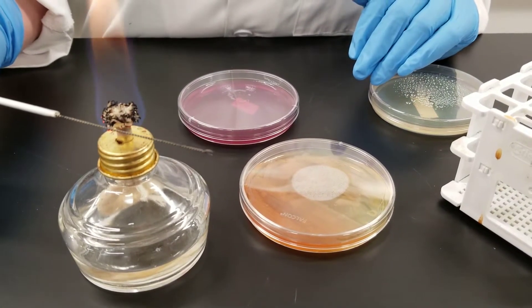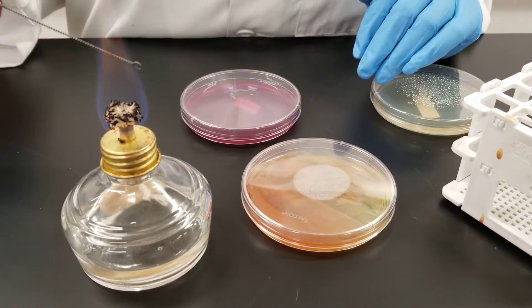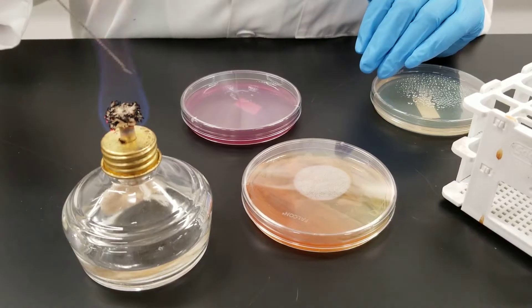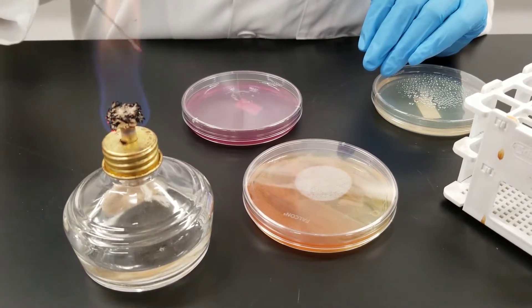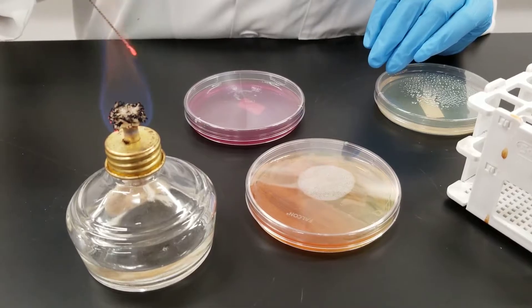I'm going to show you how to inoculate from a plate to a plate. First thing we always do is you want to sterilize the loop, get it so it's nice glowing red.